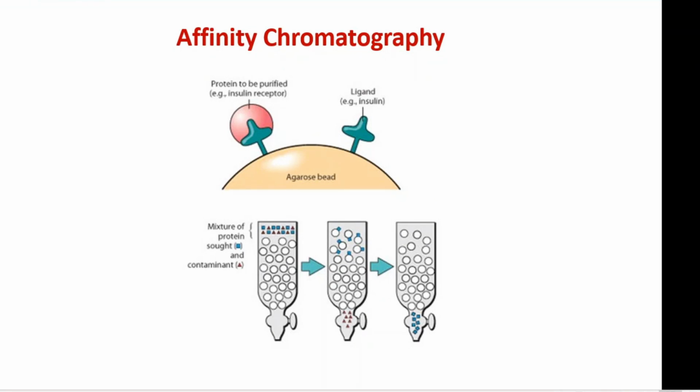Some methods may not have binding capacities, and may have a different kind of capacity. For example, gel permeation chromatography has a different way of separating. You will not have a third step, only the second step, where the molecules get separated based on their molecular size. Slowly, each fraction will have a different molecule, so that we can see.